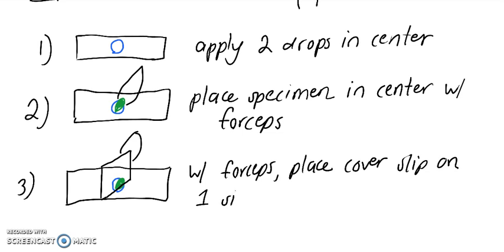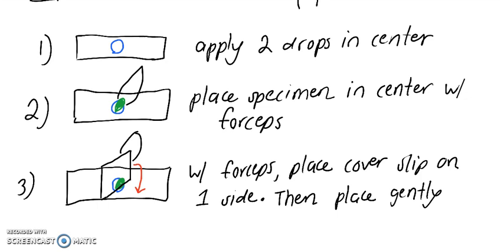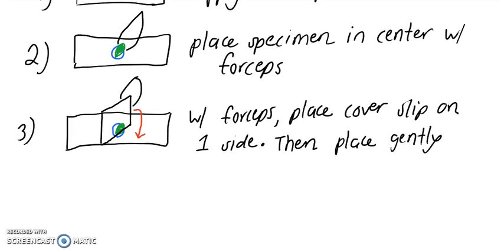On one side. And then you're going to gently lower it to cover the other side. So it will go down this way. And then place gently, or I guess you can release it to the other side. Then place gently on other side.